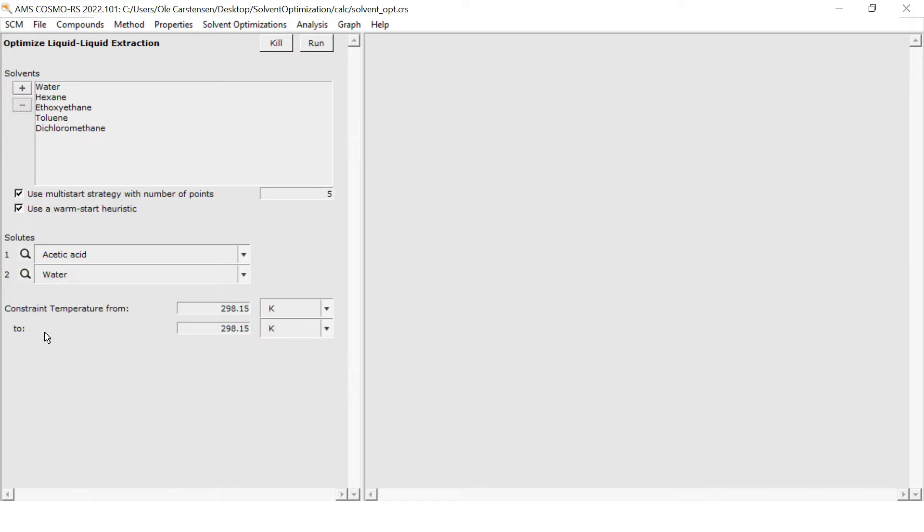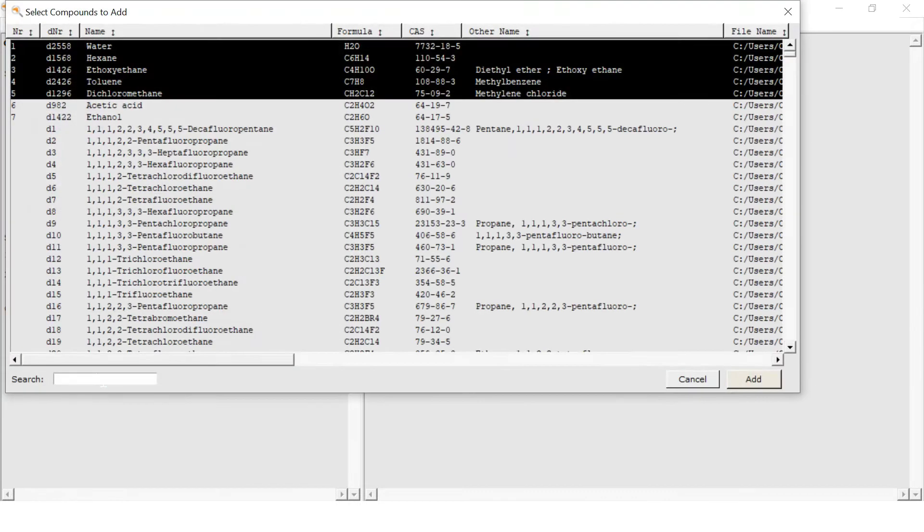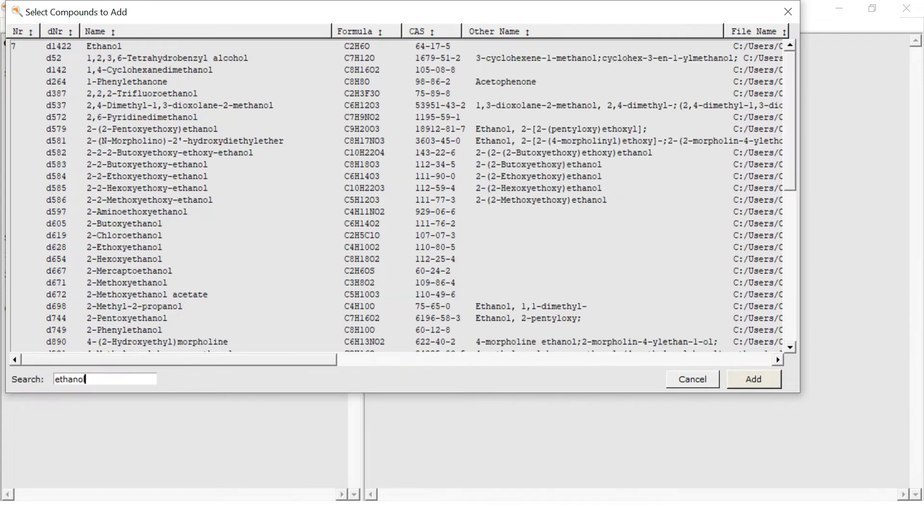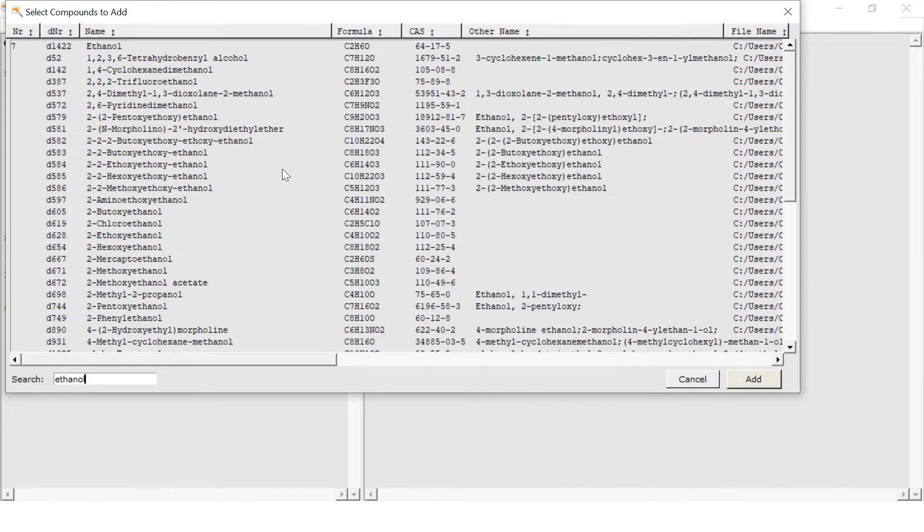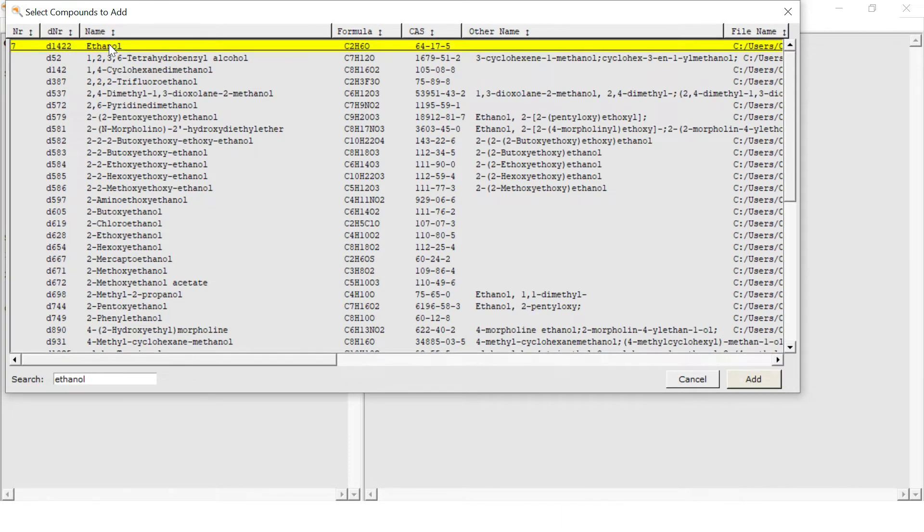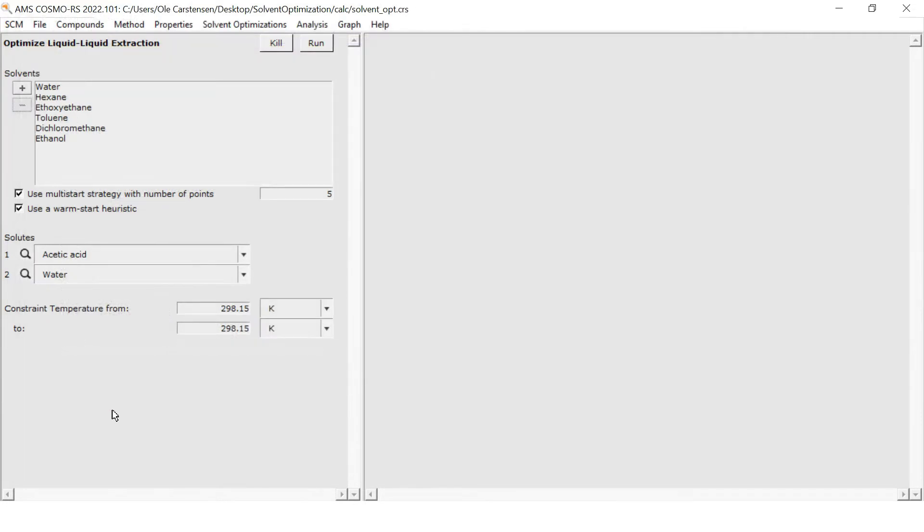Here I have opened the COSMO-RS GUI in the LLE Solvent Optimization tab. Then I have added a handful of common lab solvents from the database to the list of solvents and specified water and acetic acid as solutes.